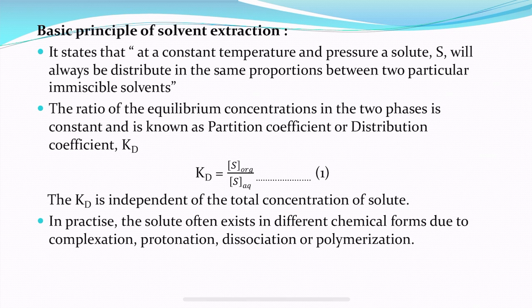I also said that solvent extraction, or liquid extraction, is considered the most popular and versatile technique of separation, for two reasons. First, it does not require any sophisticated apparatus or instruments except a separating funnel. Only a separating funnel is needed; no other instrument is needed to carry out solvent extraction.